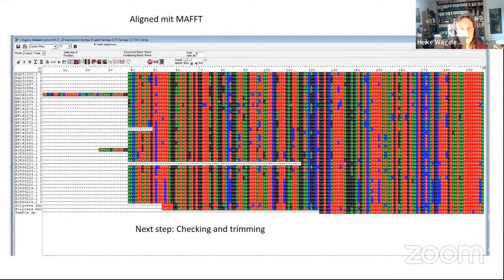This has something to do with how the raw sequences are obtained. The people who uploaded it may have cut off their sequence somewhere here because the primers are not working properly in the other region. And the person who uploaded this one maybe even included the primers, I don't know, but we would cut this off.